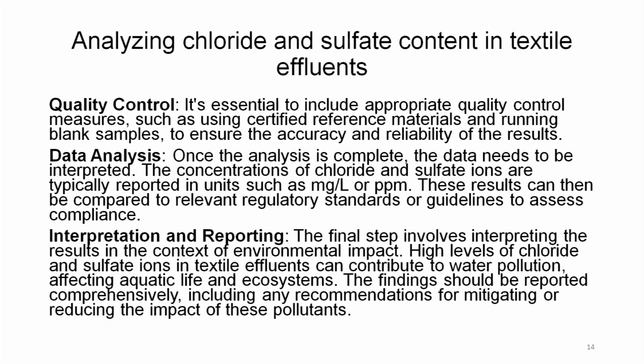Interpretation and reporting. The final step involves interpreting the result in the context of environmental impact, looking at what is the seriousness, how much of chloride can cause environmental impact or how much of sulphate can cause environmental impact is what is the main interpretation.